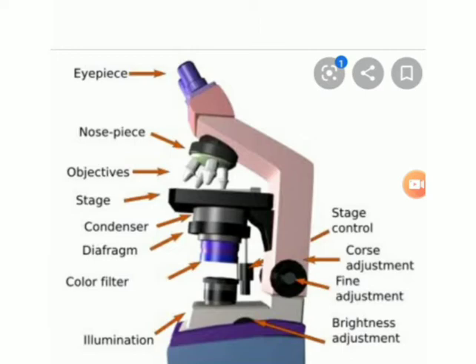Position it under the objective lens. Turn on the microscope from the power button, usually located on the back side. Adjust the eyepieces according to your focus, as the distance between eyes varies from person to person—the intercanthal distance.